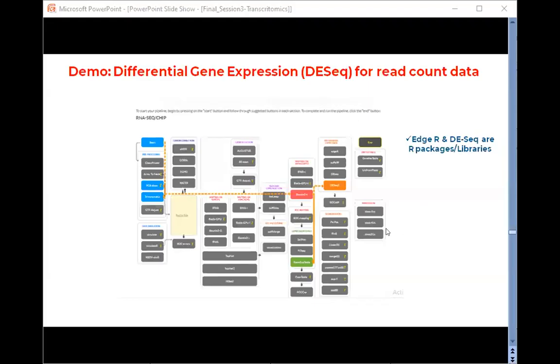So let me just share again, go back to the presentation. The t-test and DESeq can be applied when we have two conditions. What will we do if we have multiple conditions? Even in our data, if you look at the gene expression table, we have cancer subtypes, that is ER positive and triple negative.